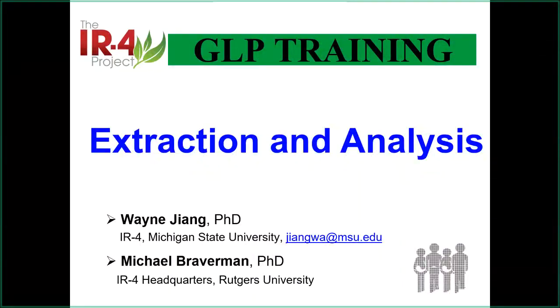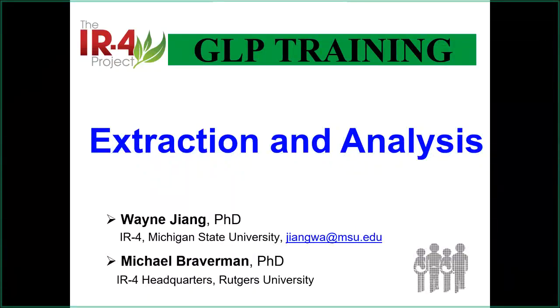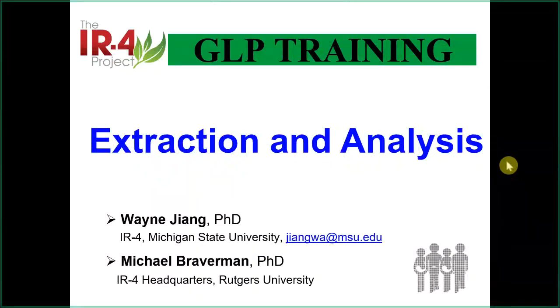We go through the PowerPoint slides, and this is a little bit different from what I usually do in face-to-face training, but this is just like the content combined with the lab practice and the GLP. Okay. So today we're going to talk about the extraction and analysis. We have the samples now in the lab from yesterday. Now the next step is the analysis.